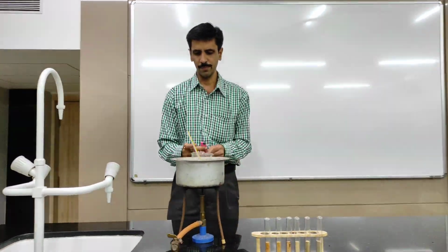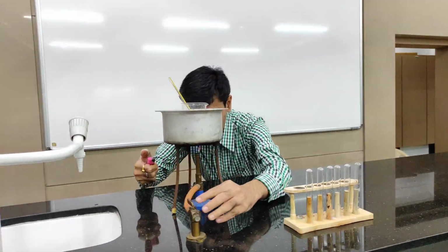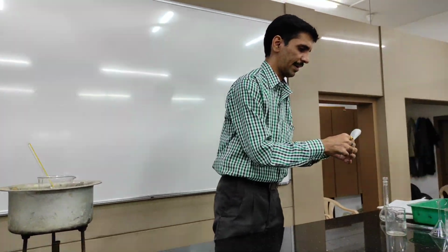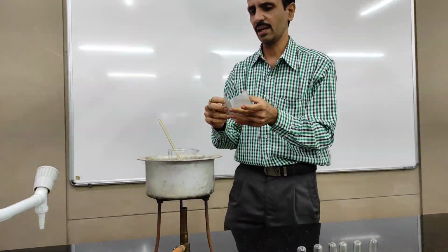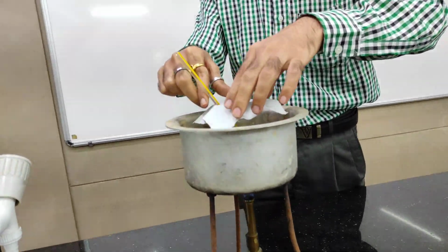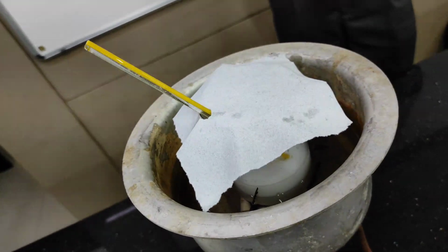and we are going to start heating it. Here we go, and that's going to go on for 20 minutes, making sure that we cover it during this process so as to avoid any entry of foreign materials into the beaker which contains our precipitate. So this is the way the arrangement is, and it has to be carried out for around 20 minutes. I hope you have understood up to this.